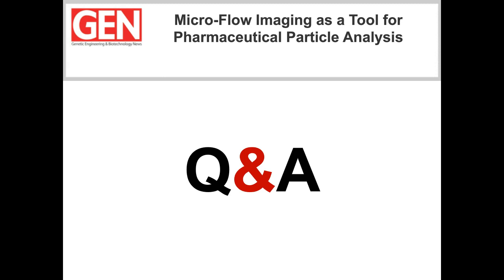And maybe one last point I would like to mention is that if you would like to obtain additional information besides size distribution, such as agglomerate percentage with the MFI, then the MFI data processing is rather time-consuming and really requires a certain level of expertise. But of course, you do get the extra information, and you may also use the help of external software, such as the open source software R, ImageJ, to process MFI image files. But this is also a point to keep in mind. So hopefully this answers the question.